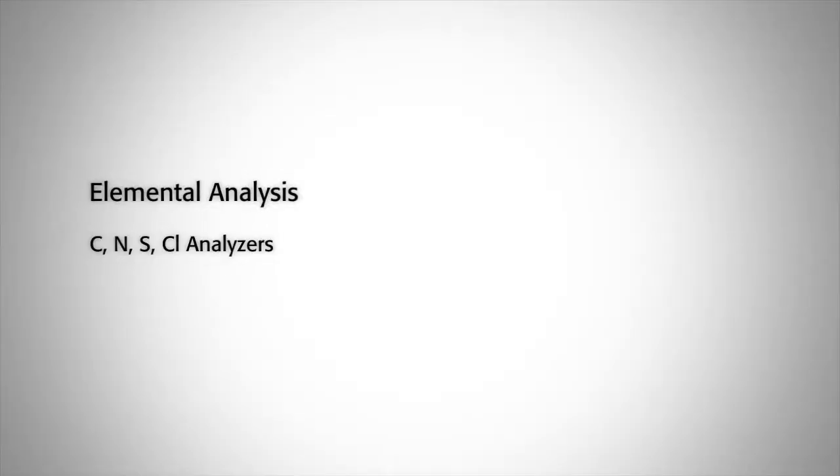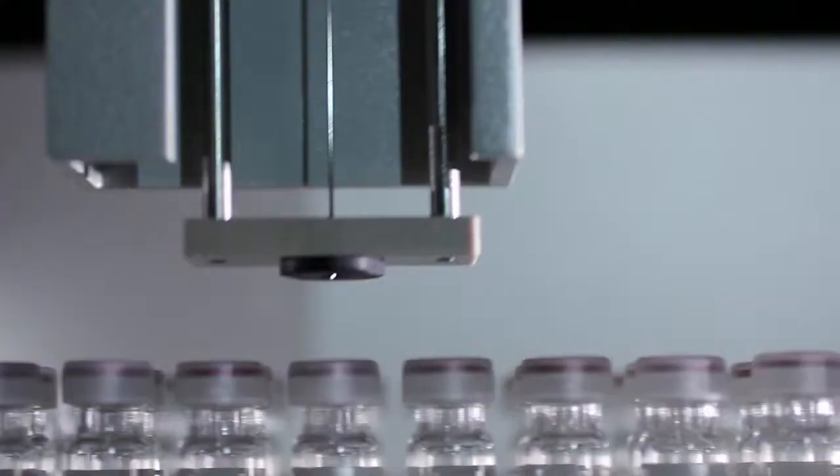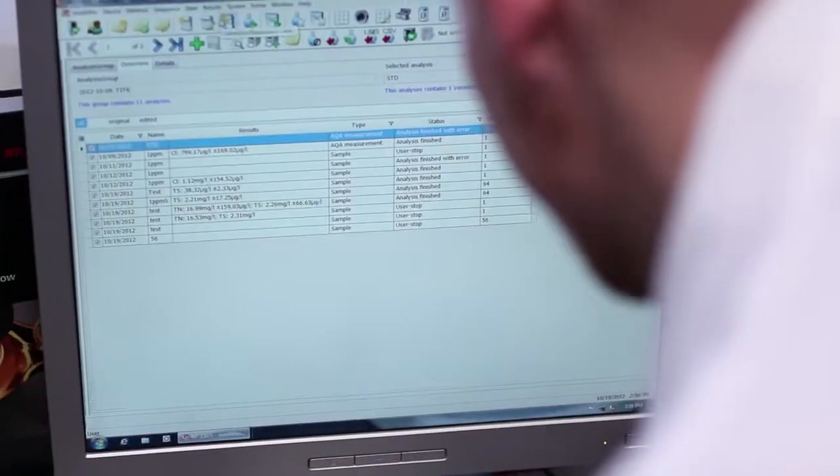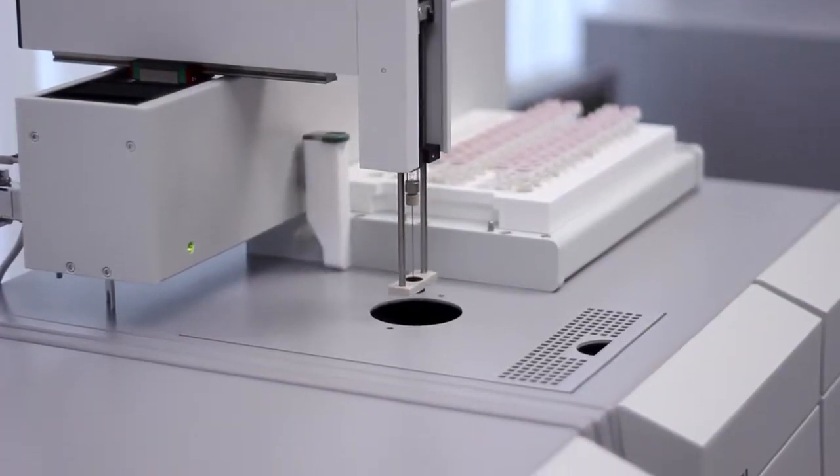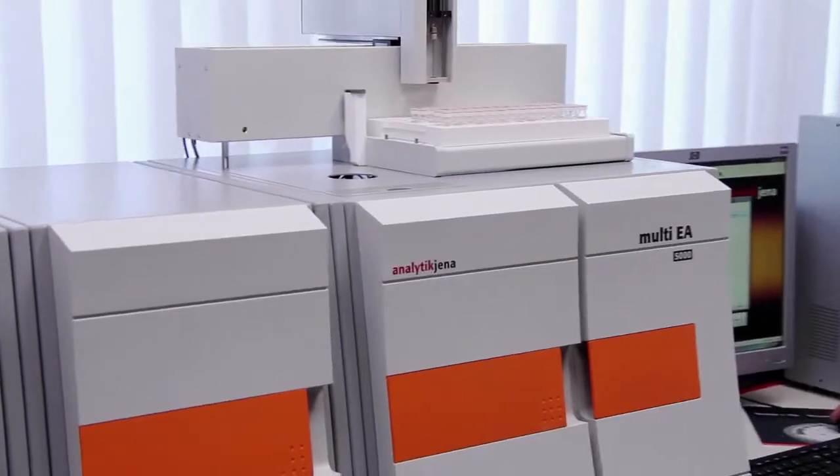Multi EA 5000 was particularly designed for petrochemical applications. It is a real multi-matrix analyzer capable to detect carbon, sulfur, nitrogen and chlorine in liquids, solids, gases and LPG samples. Progressive technologies like double furnace and flame sensor control combustion guarantee convenient operations and always best results.